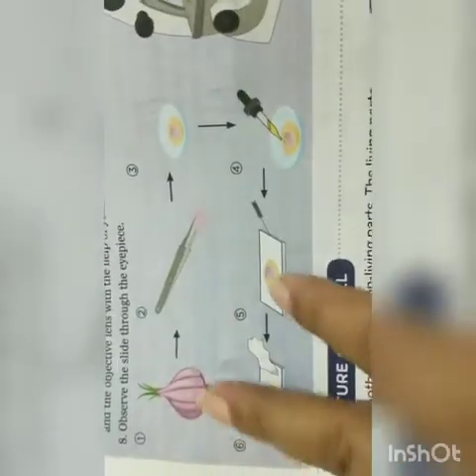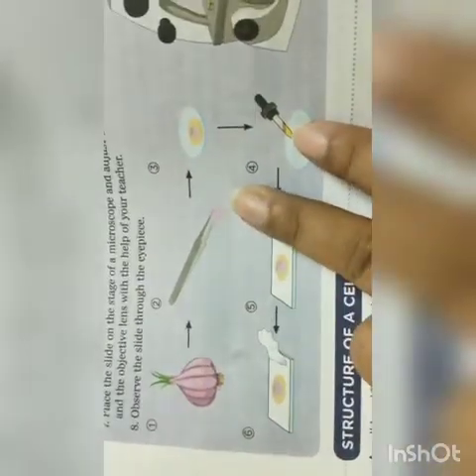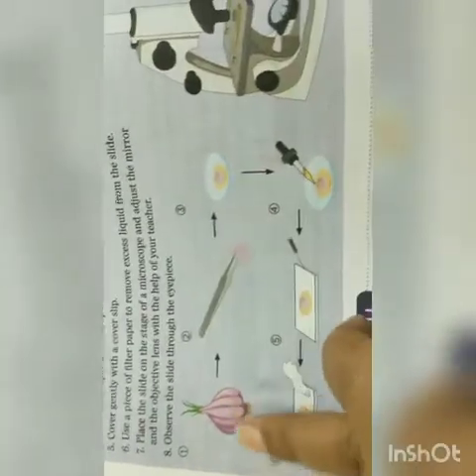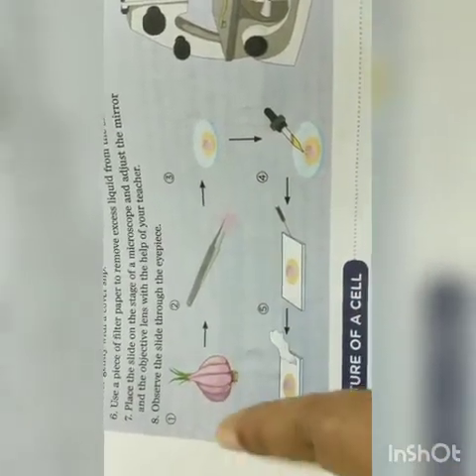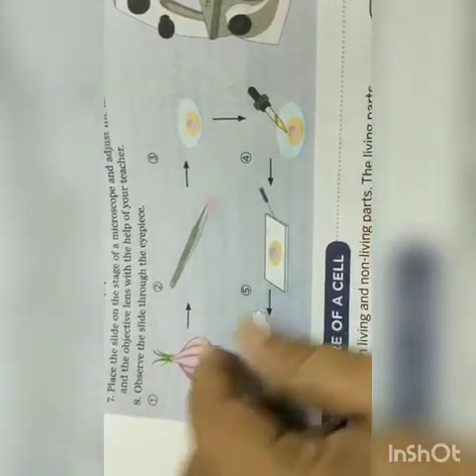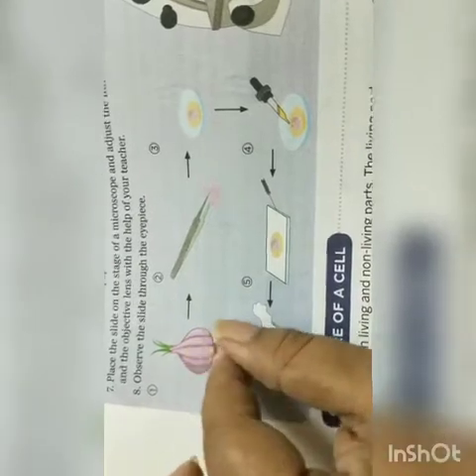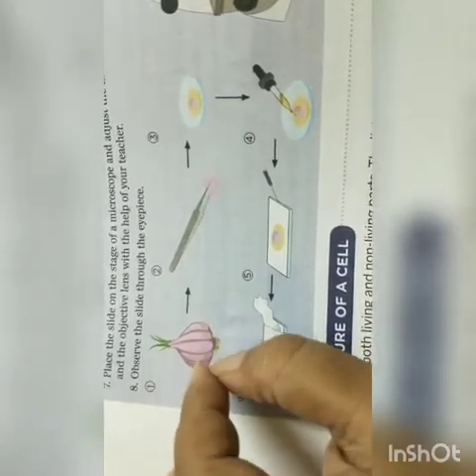Now here, suppose an onion peel is taken. All of you read this activity properly. Here it is given: one onion is taken, we remove the outer cover of the onion and take one inside peel. It is a light white part, the skin there.